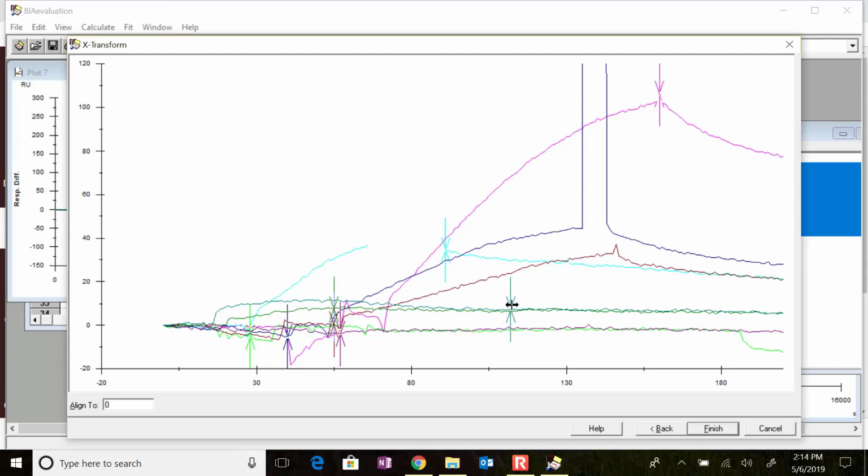Now the one thing that's difficult is I can't see it for this data line. These low data lines, very hard to see. But I can go back and I can just approximate for this one. And then my later ones I can do differently. Okay, so let's try to do it for each line. This is another one where I can't really see what's going on, so I'm going to have to go back and do that another time. And slide it along to see which one it goes to.